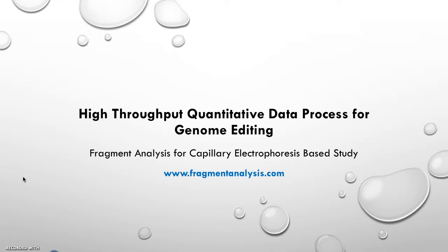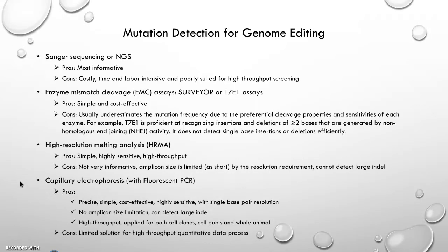High-throughput quantitative data process for genome editing. Fragment analysis for capillary electrophoresis-based study, by fragmentanalysis.com. There are multiple strategies of mutation detection for TALEN, ZFN, CRISPR-Cas9 mediated genome editing.